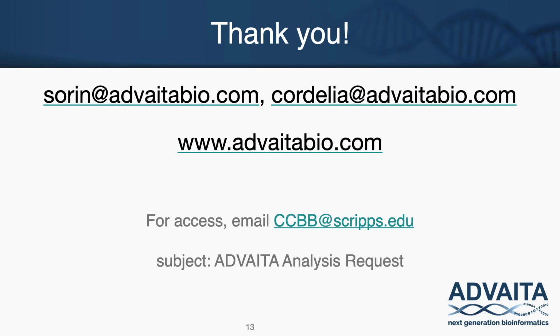Okay, yeah, so Alan just sent me another link about gene matrix. Can we do all the analysis options presented today on our own on the platform? Yes, everything we did today is available to you. Once you get your results from CCBB, you will have access to exactly the interactive format that we went through today.